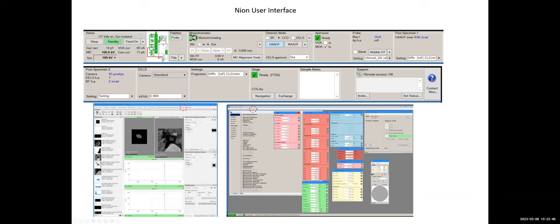Also, you can click use. Click here where my mouse is showing, and then this will change to use. So you can see that the real camera length is defined by four projector lenses and then another module here. That's the situation on this Nion microscope. But in principle, it's just two modules to control camera length. The camera length is still the same, but you just have an additional module that gives you more flexibility to define your experimental condition. So that's why some people think this Nion microscope is complicated and hard to operate. It just shows you more options.